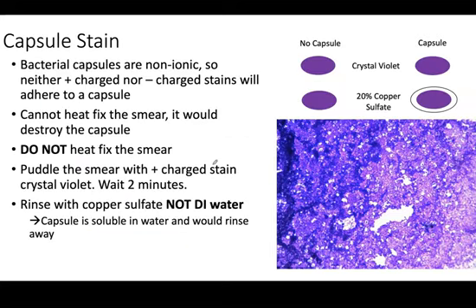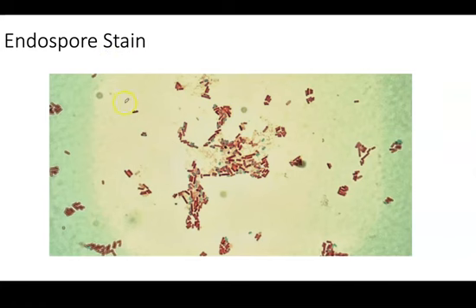There's one more stain that I want to introduce you to, and here it's entitled a capsule stain because it's telling you what structure we're trying to stain within a bacterium. There's another name for this. It's called a negative stain. And the reason I bring that to your attention, because all the previous stains weren't classified as negative stains because, let's go back. The structures that we're interested in, like here the bacteria is red, here the spore is green, and so the structure that we are interested in has the dye color.